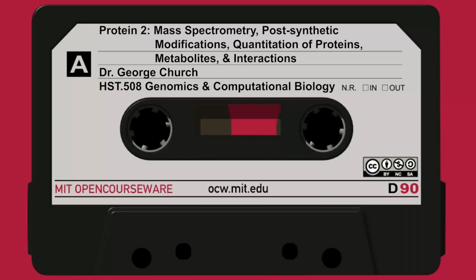Size is something that will be a recurring theme tonight. We'll be talking about the mass of protein complexes, the mass of individual protein subunits, and the mass of peptides cleaved out of those basic subunits. And you can see there are quite a number of different methods. Sedimentation velocity will be one that we will use, gel electrophoresis, and so on.